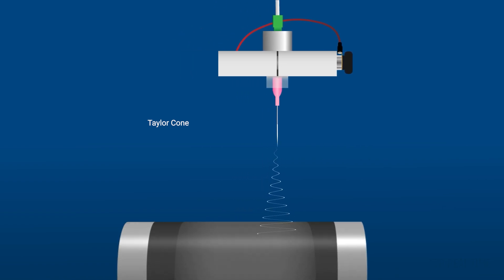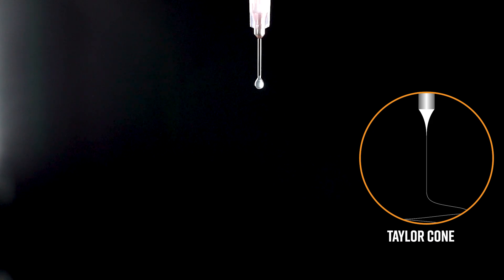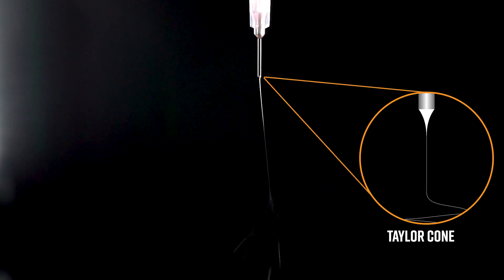So what's this Taylor cone I keep mentioning? The Taylor cone, named after the British physicist Sir Geoffrey Taylor, is the conical shape formed at the tip of the polymer solution as it exits the needle. It's like the maestro of electrospinning, and here's why it's so important.